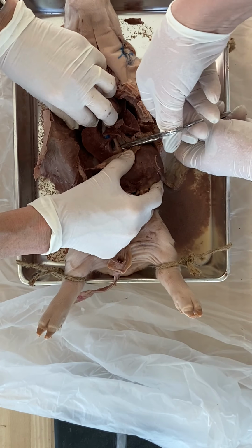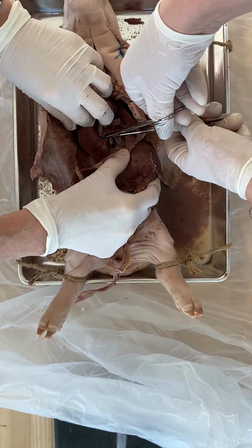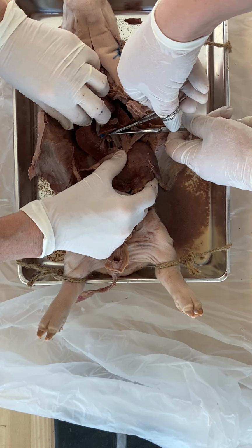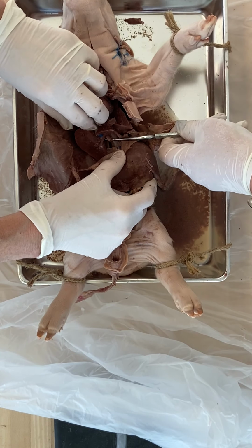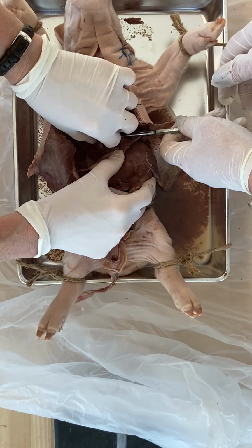All right, so we have... That looks more blood vessel-y, doesn't it? It does. But look at it. It's the closed tube. That's the esophagus. I don't know. That's pretty firm. You feel it? That's pretty firm. It is.